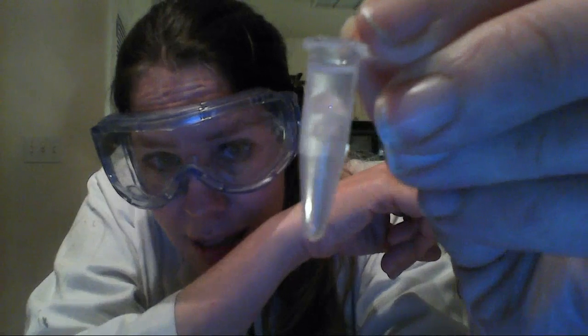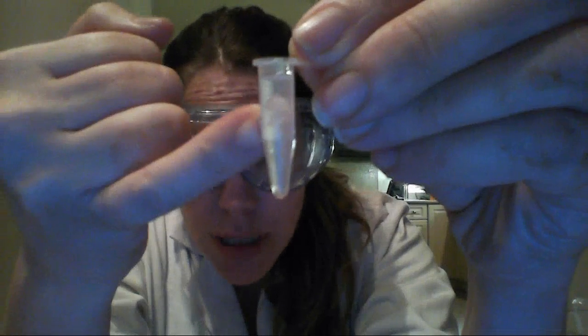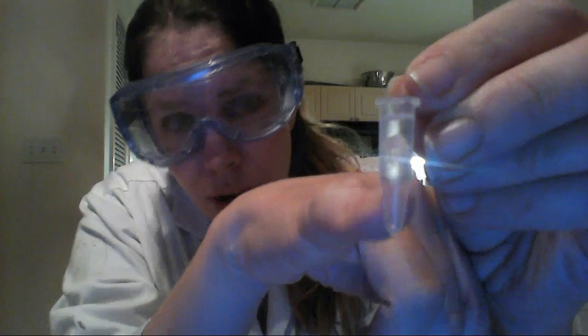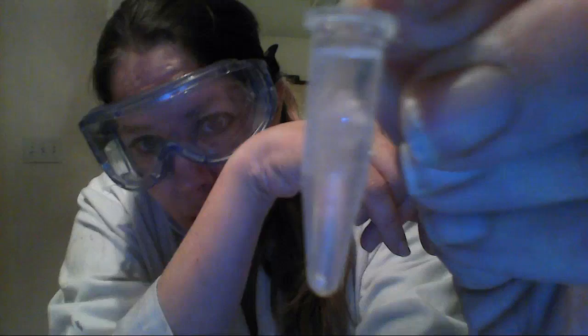That's my DNA. And to think, that contains all the genes in your entire genome. So theoretically, there's enough of your genes in here, all of the genes of your body, to make a complete clone of yourself. How cool is that? All inside your little soon-to-be necklace. So once you have it, you want to make sure there's enough ethanol, enough of the liquid, so that the DNA doesn't dry out.